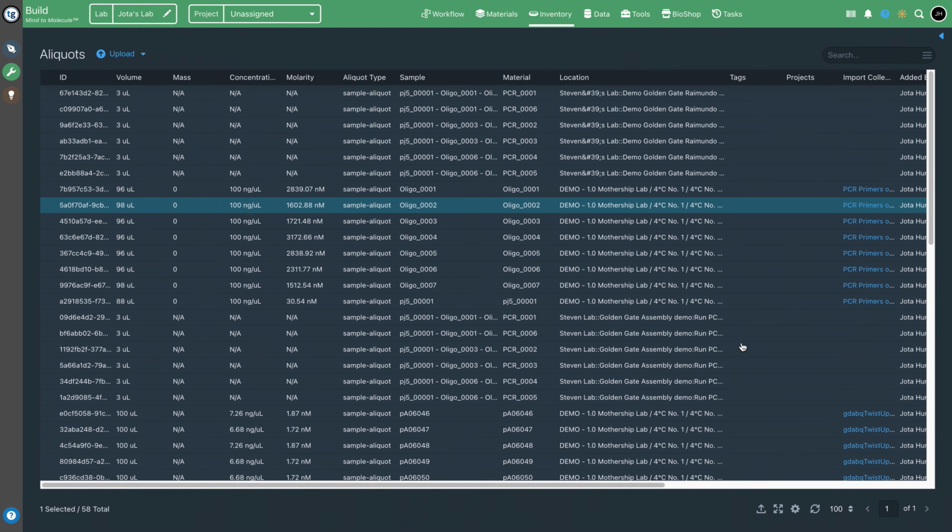So that's regarding inventory management. Of course, as I mentioned before, you have freezer management. You can track reagents, you can track expiration dates for reagents, and anything that's needed when you are using a proper lab inventory and information management system.